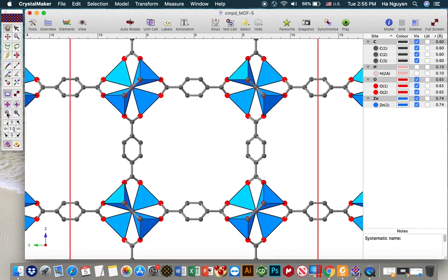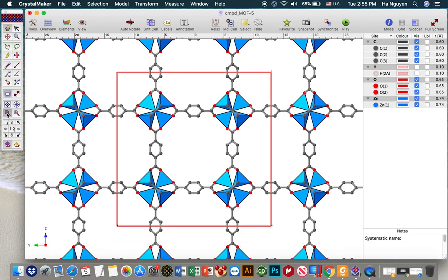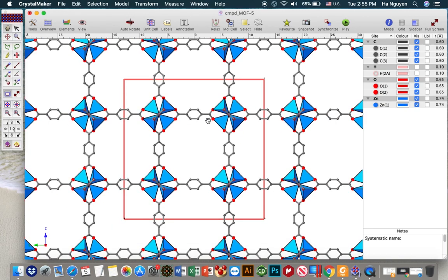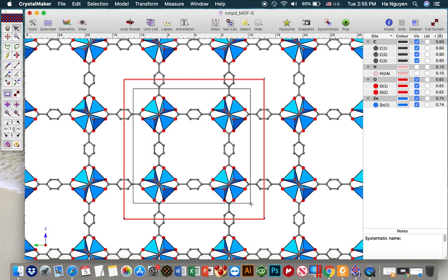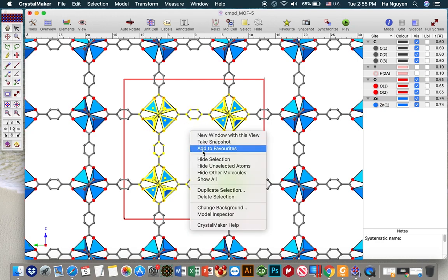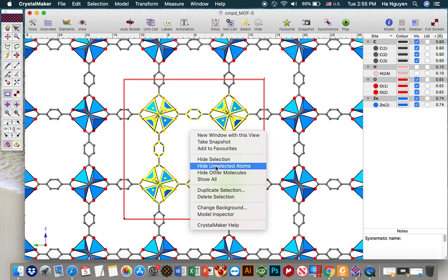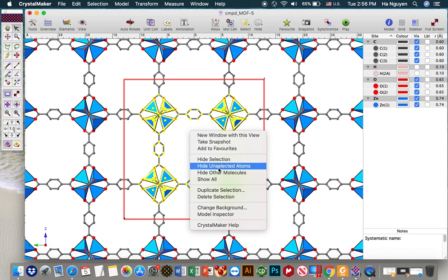I will make it smaller to fit my screen, and then let's say I want to show only one kind of cage instead of showing a lot of cages. So to do that you can use the selection tool to choose from here to here. So if you want to show the selected region, you can right-click and then you hide unselected items. So here we want to show the selection, so we will have to hide unselected items.